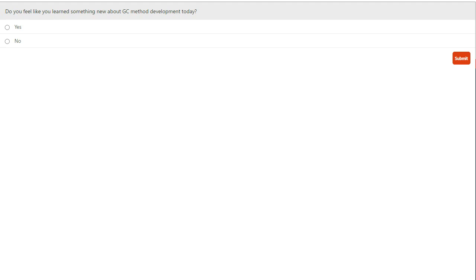Okay. Time for just one more question. I'm running a FAME analysis with an FFAP column, 30 meters, 0.53 millimeters. Compounds are methyl esters of C16, C18:0, C18:1, C18:2, C18:3. I just learned that the solvent should be close in polarity to the analyte, but I have been using hexane. Should I switch, and what would be a good choice?